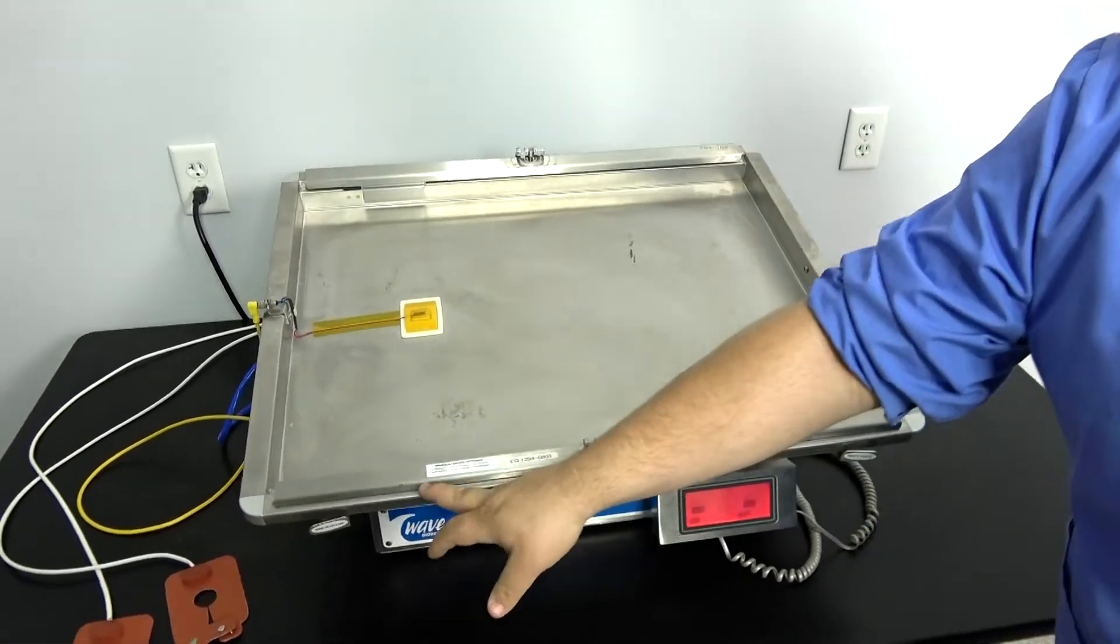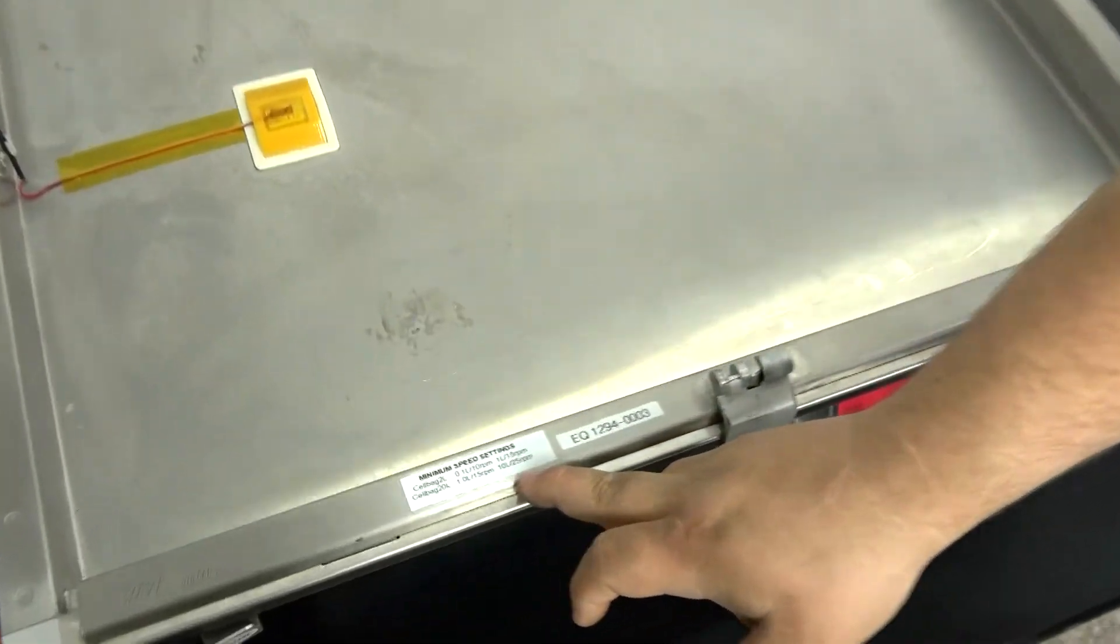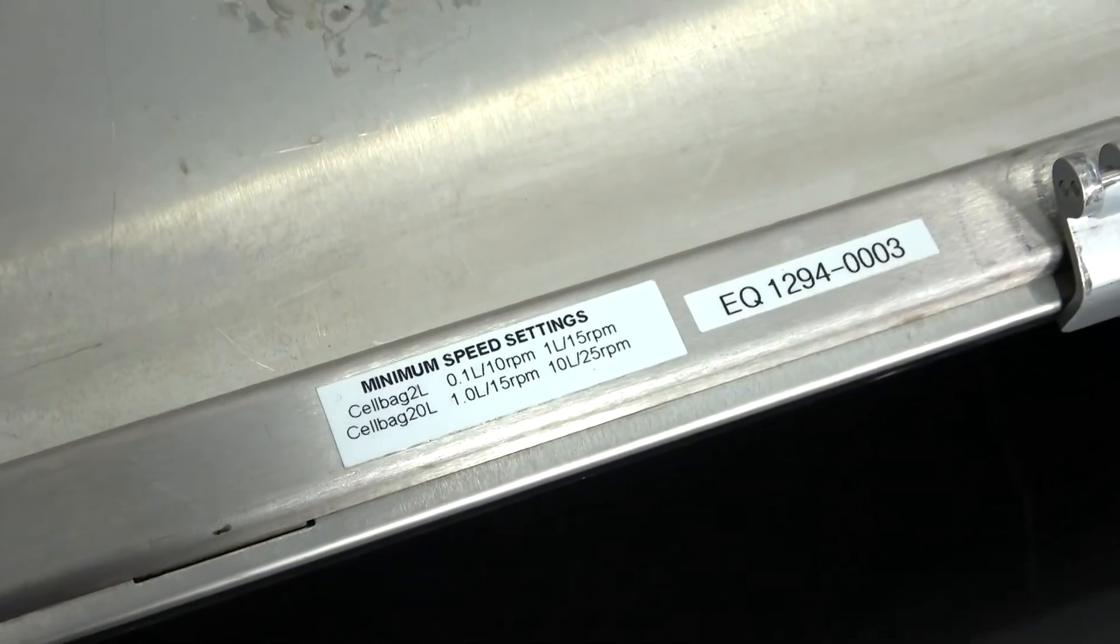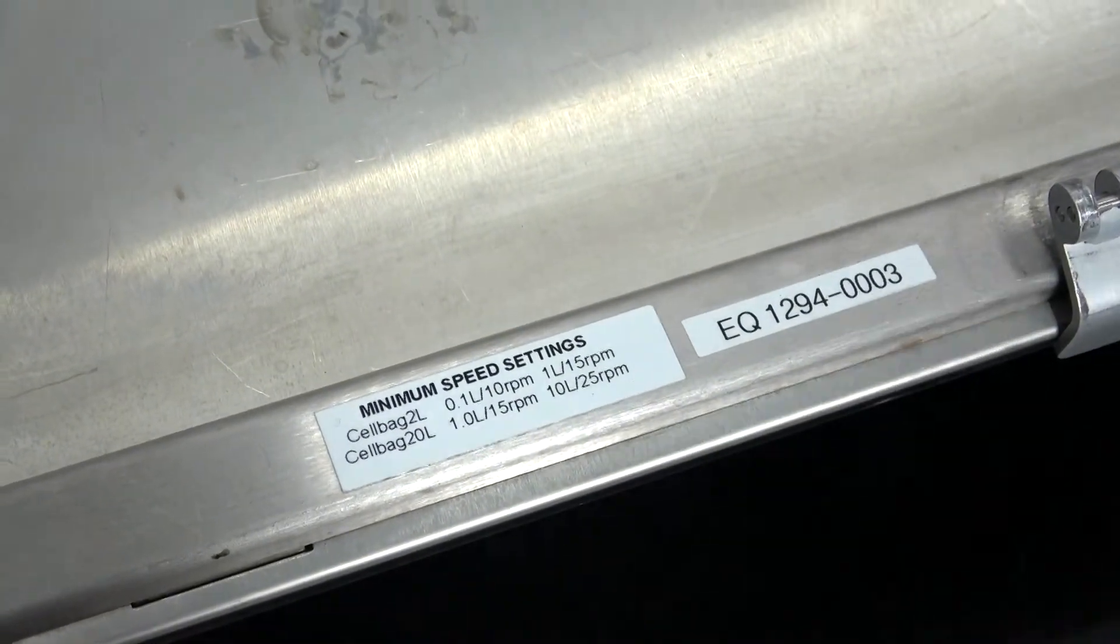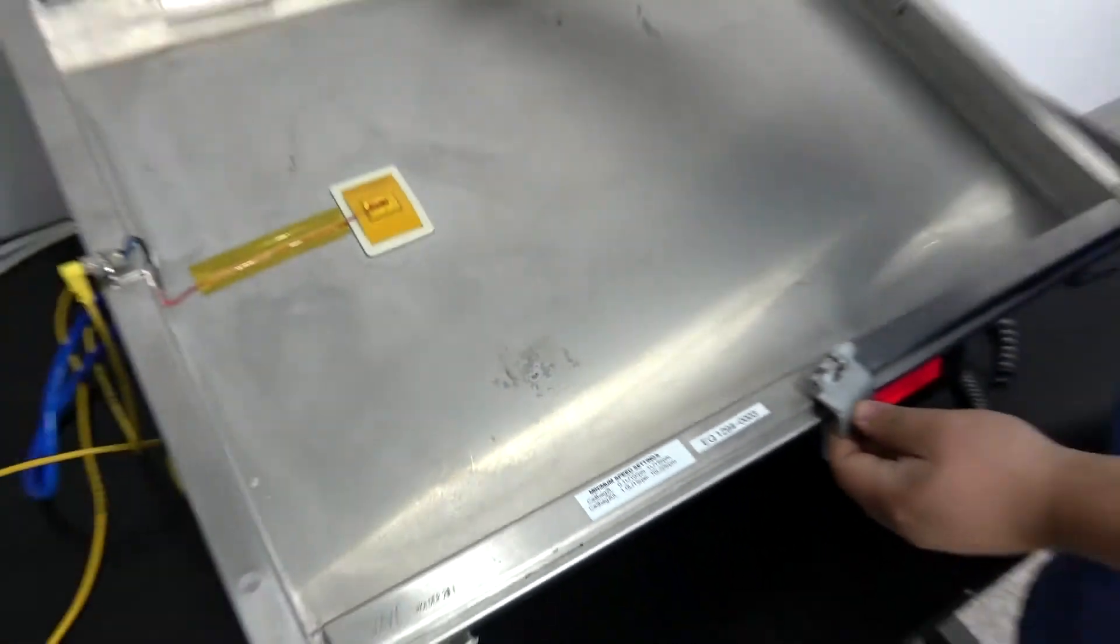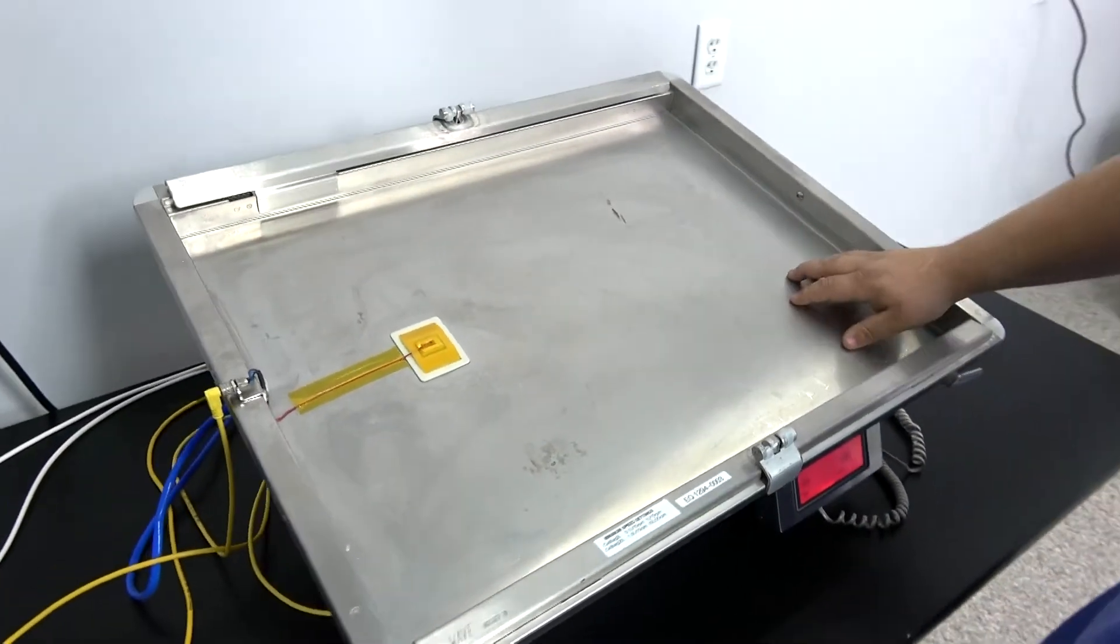Right here is your minimum and maximum speed settings for your bag capacities. Right here are your clips to make sure your bag is secure while it's rocking.